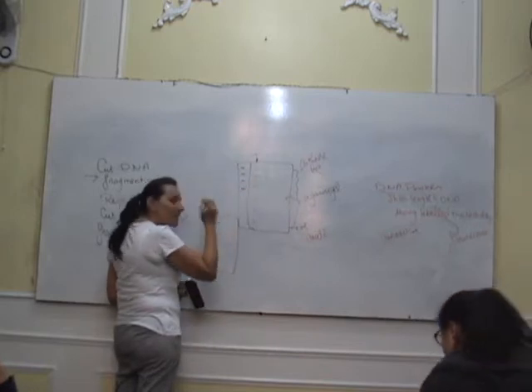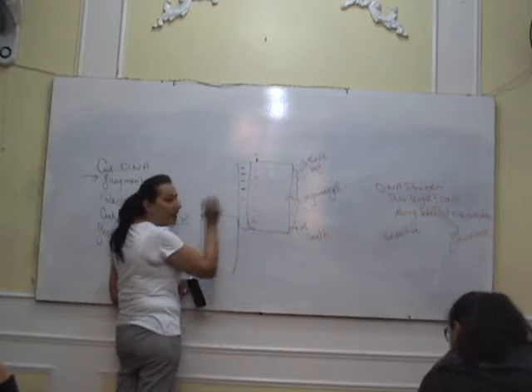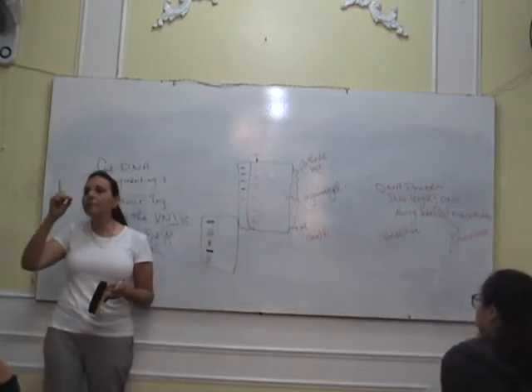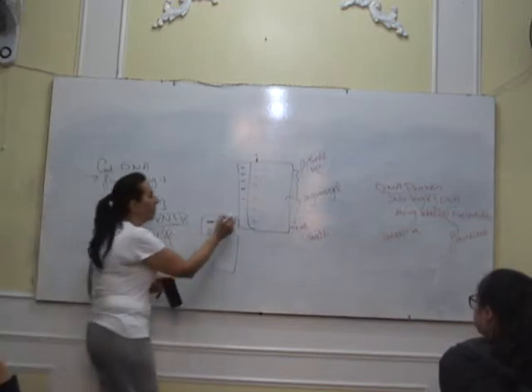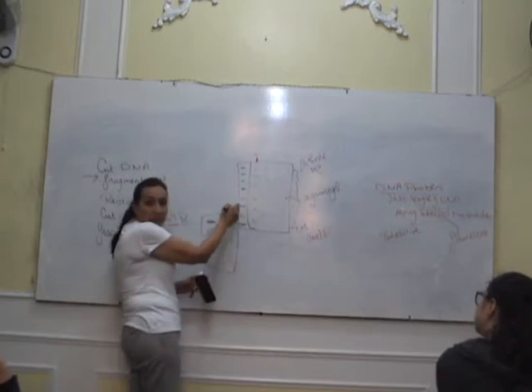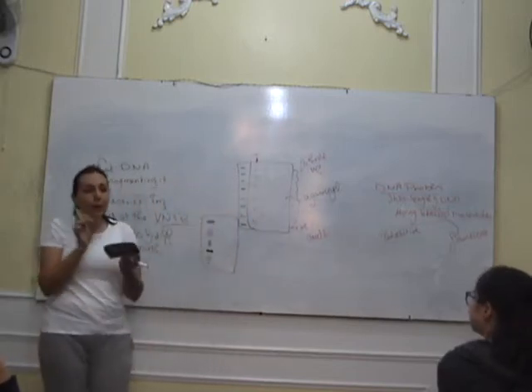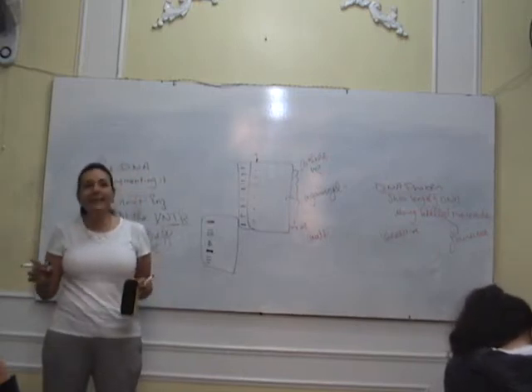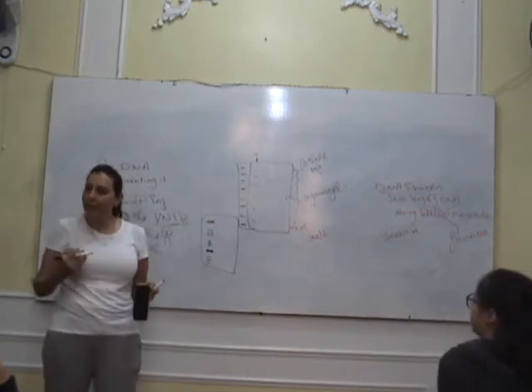It has separate, specific bandings of DNA with known distances. You can say, for example, this band is at this distance from the anode, and this band is at this distance from the anode. And it is known that each band is made of how many bases. It's like a scale for the DNA fragments.